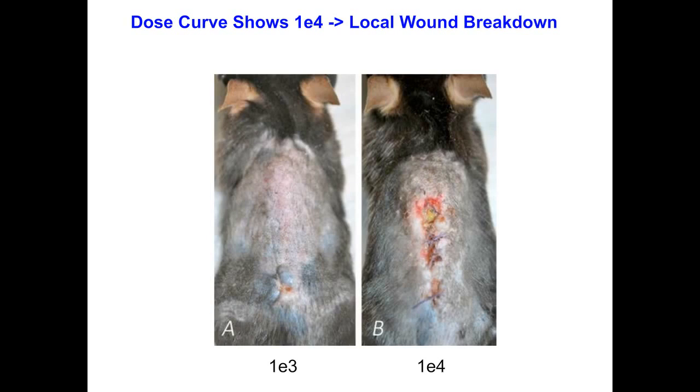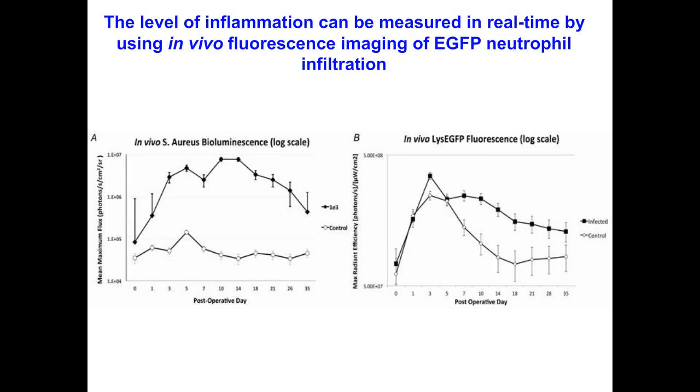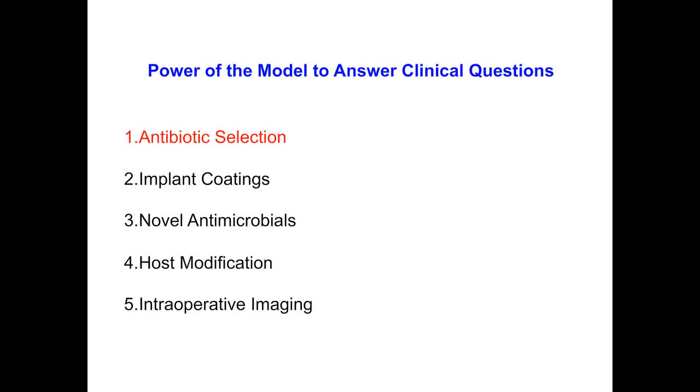So I just want to spend 5 minutes here showing you some of the applications, and some of this is preliminary data, some of it is published data, but if you look at some of the questions these models answer for us. So when we get our implants infected, we always debate with our infectious disease colleagues, what antibiotic do we treat these patients with? So we decided our model could answer this.